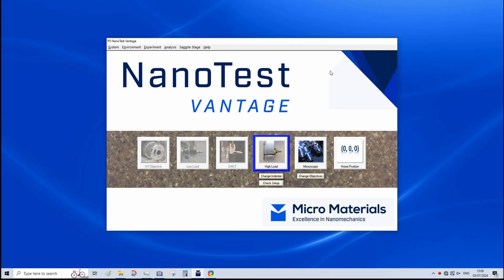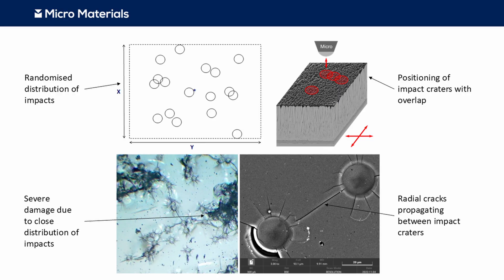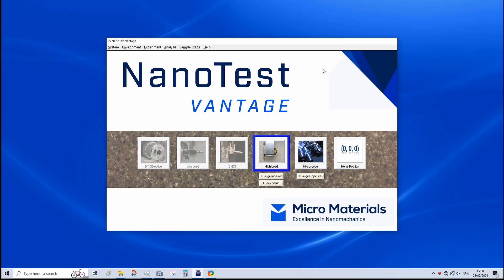Now we've seen a typical repetitive impact test. We will explore the randomized impact test method. Randomized impact test allows a programmed number of impacts to be distributed within a specified region of the sample in order to directly study how damage from one impact affects subsequent damage. This allows for simulation of impacts in a methodology more similar to erosion where particle impacts impart energy across an area. The technique is particularly well suited for studying damage mechanisms on thermal barrier coatings and exhibits good correlation to erosion tests both in terms of damage mechanism and wear rate.